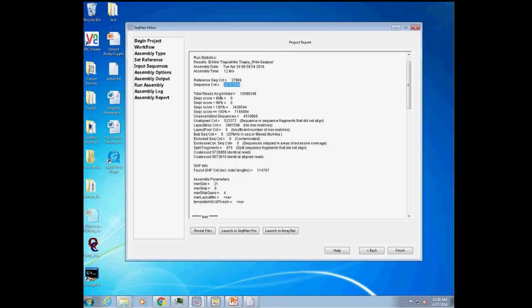RNA-Seq data sets, especially from non-model organisms, vary a lot. Sometimes there's a lot of ribosomal RNA. Even though it's been ribo-depleted, we'll see a lot of ribosomal RNA present, sometimes genomic, and they vary a lot depending on how the samples were prepped.